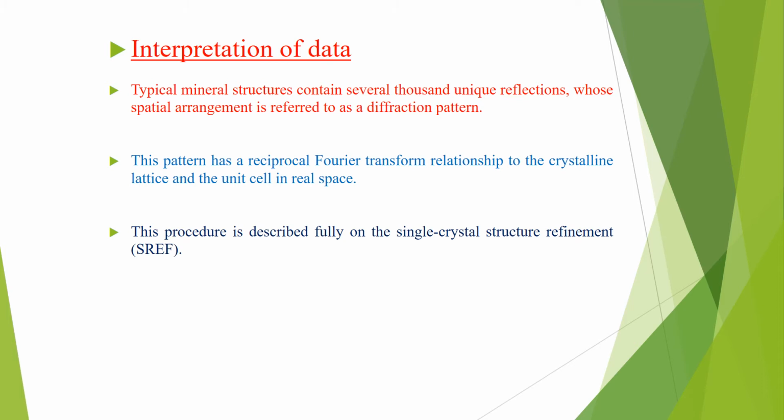This step is referred to as the solution of the crystal structure, and after the structure is solved, it is further refined using least squares techniques. This procedure is described fully in single crystal structure refinement, SREF.